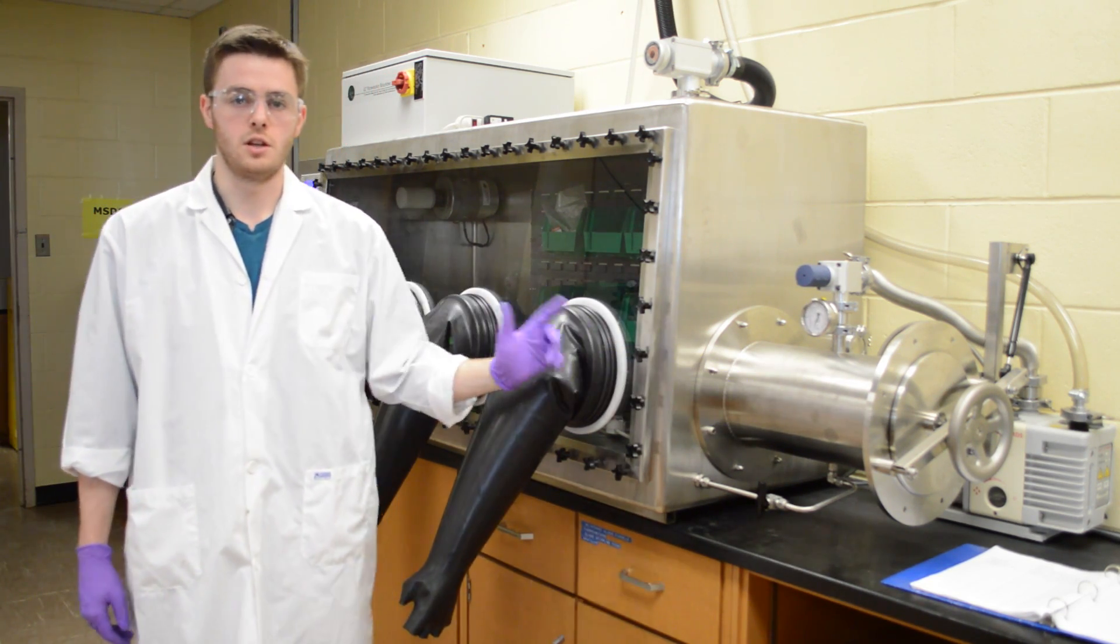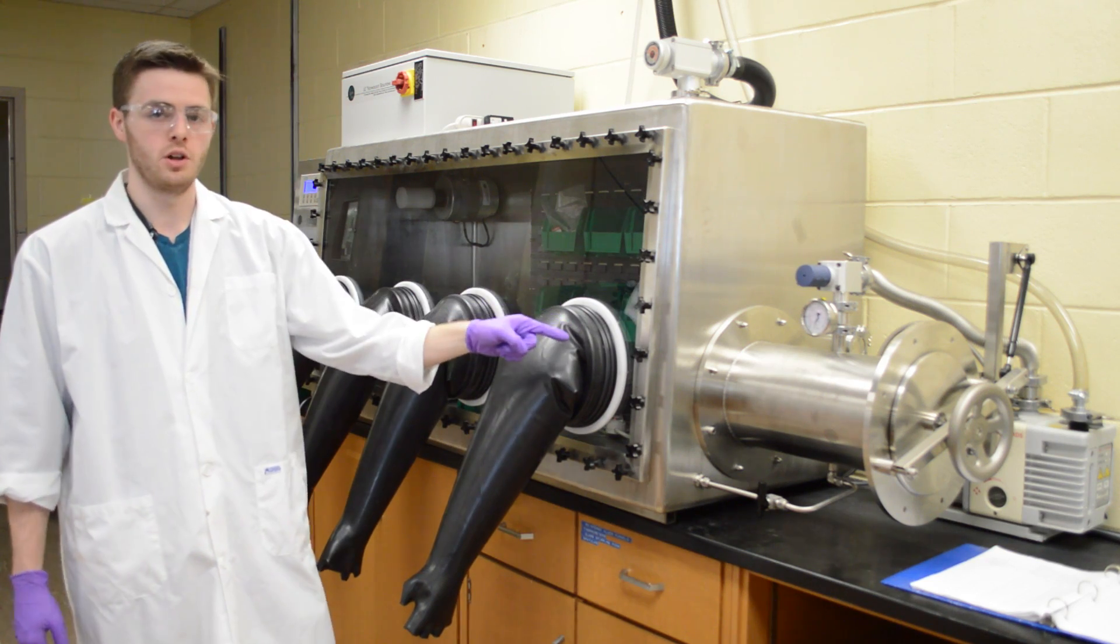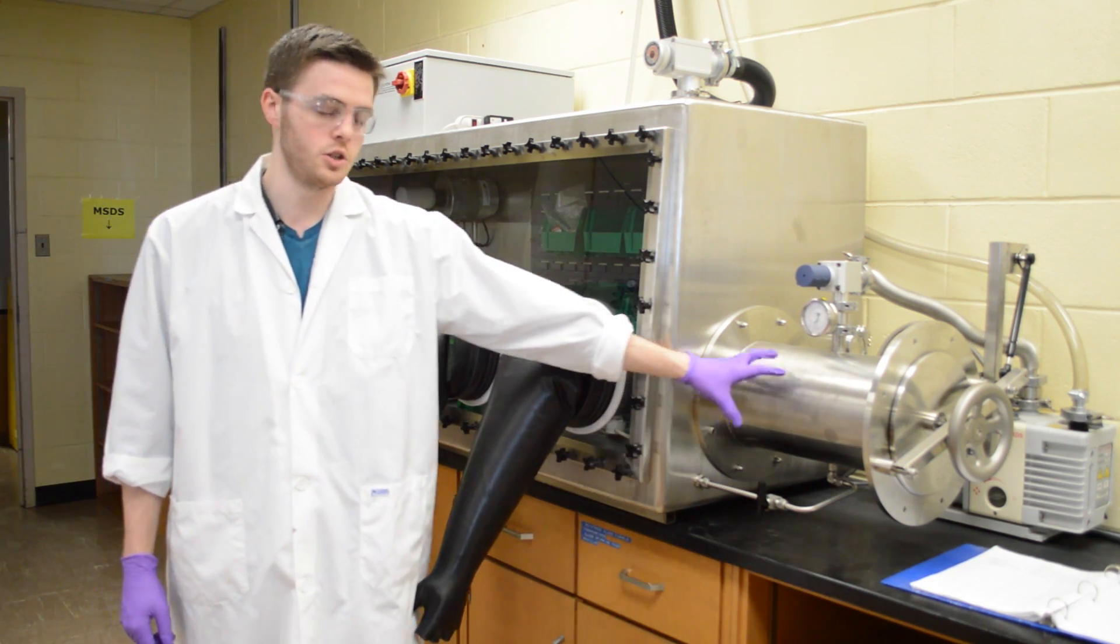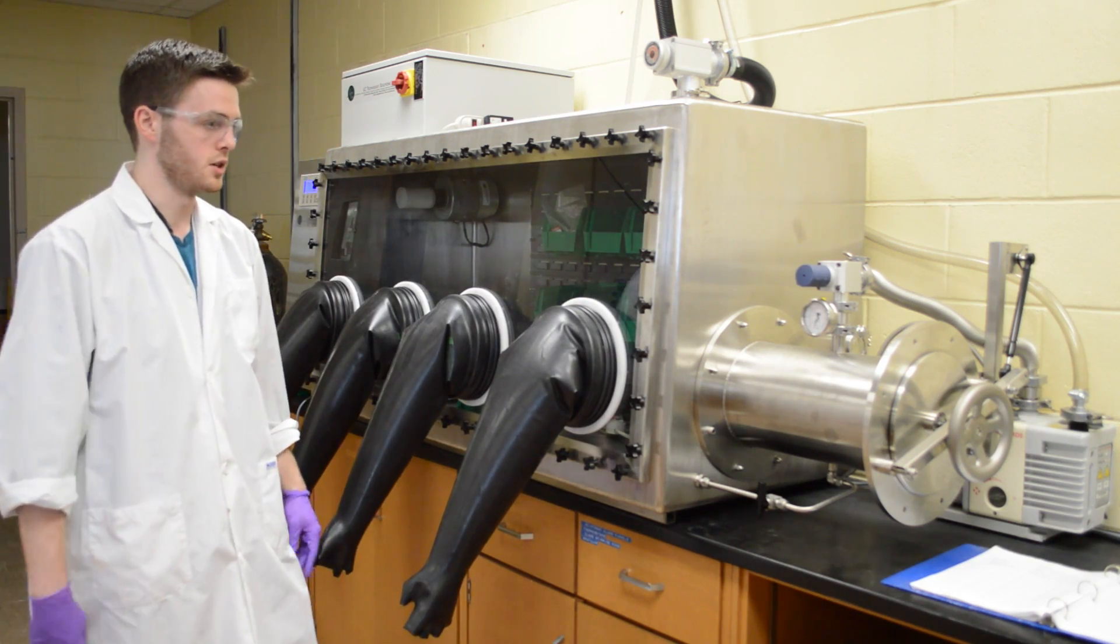We'll use this anti-chamber to bring things in and out of the glove box. This supplies a vacuum as well as being able to fill its atmosphere with just nitrogen alone, so that way we can use new things inside.